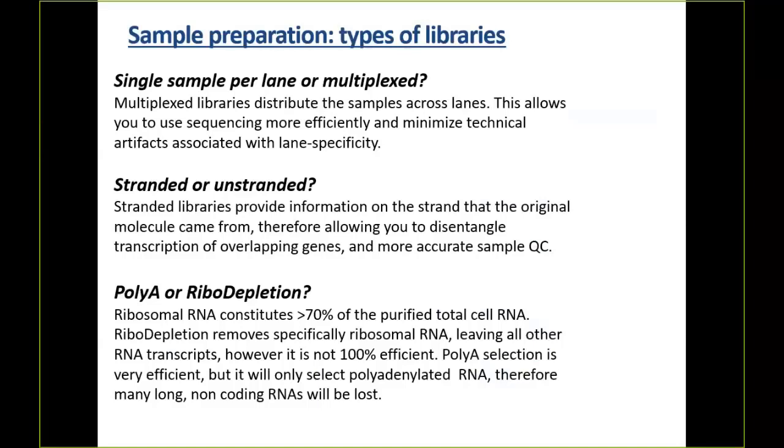Stranded versus unstranded. This comes up for certain applications. This is especially important, for example, if you're dealing with RNA-seq, and it's especially important if you're dealing with RNA-seq from viruses.